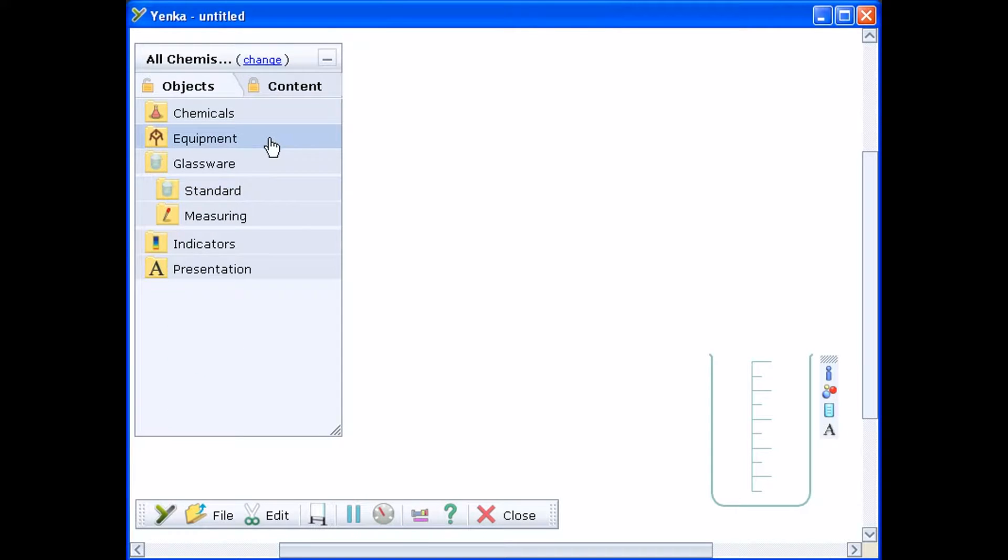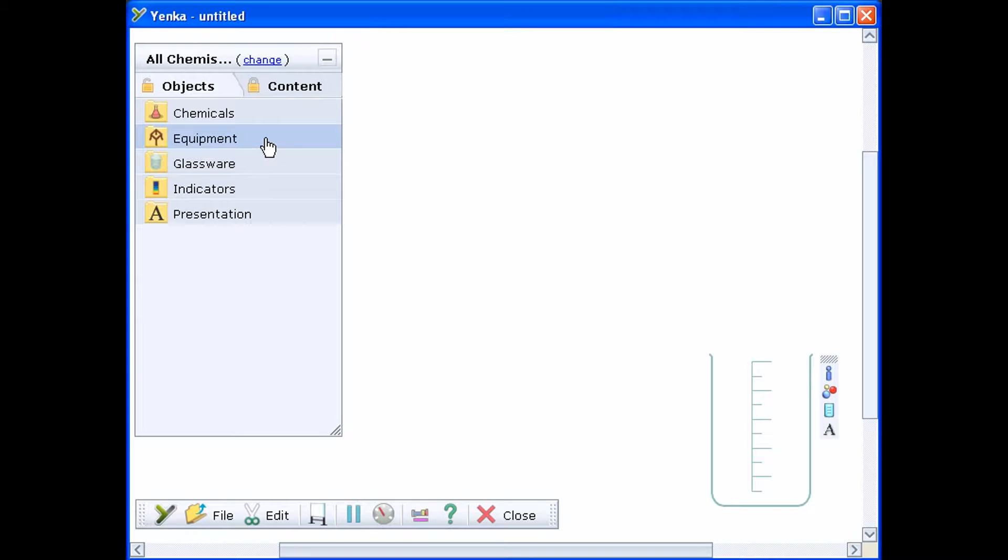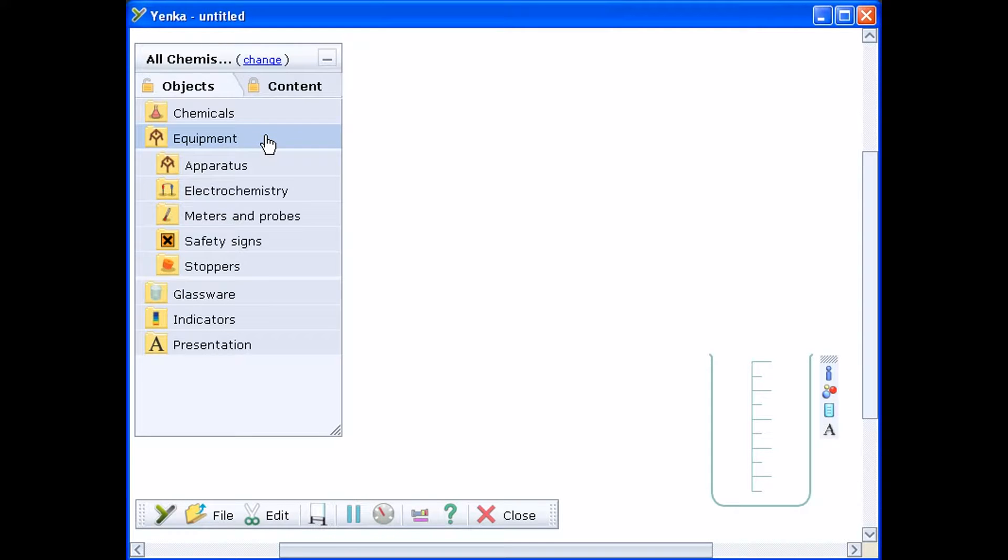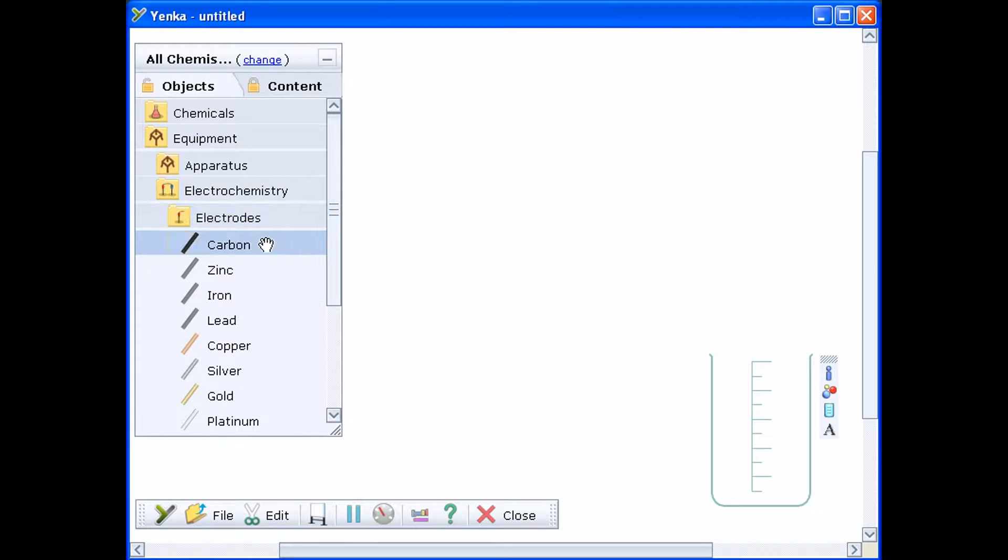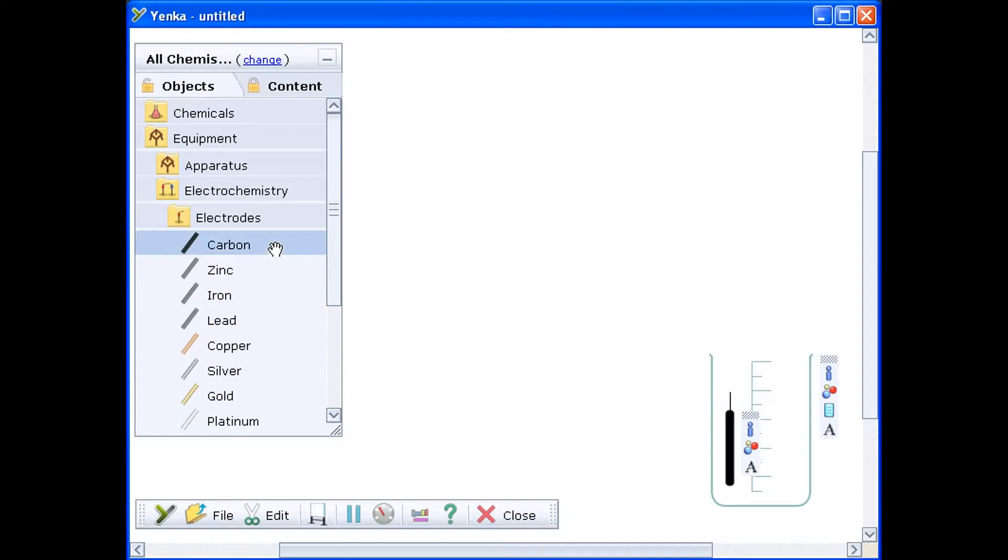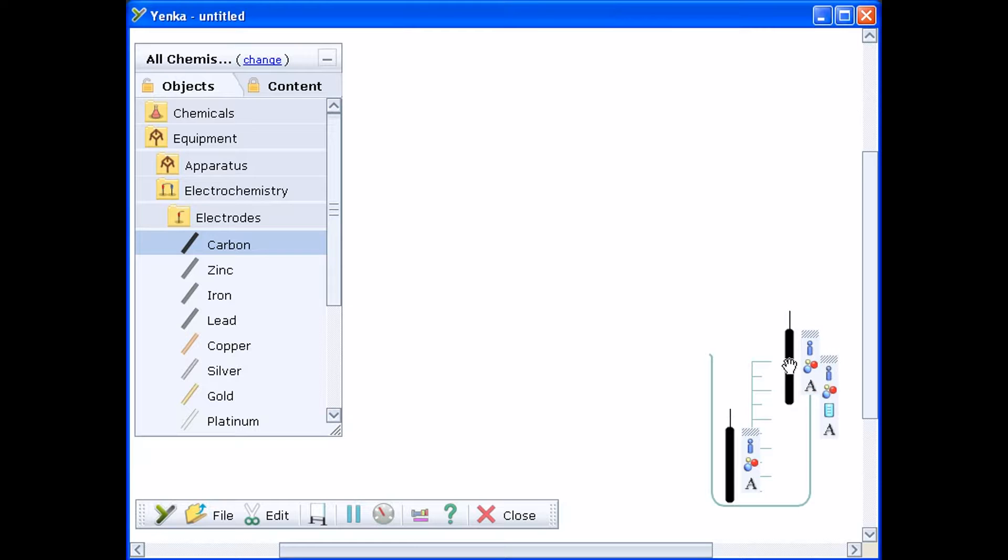Electrochemistry equipment is found in the electrochemistry section of the equipment folder. There's a wide range of electrodes to choose from. Here we'll start by dragging on two carbon electrodes. Drop the electrodes into the beaker and they'll fall to the bottom automatically.